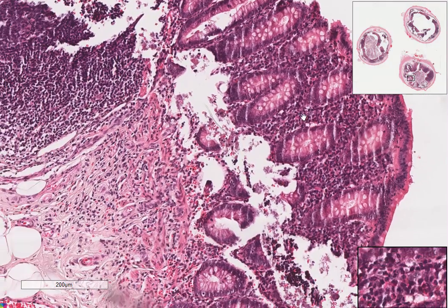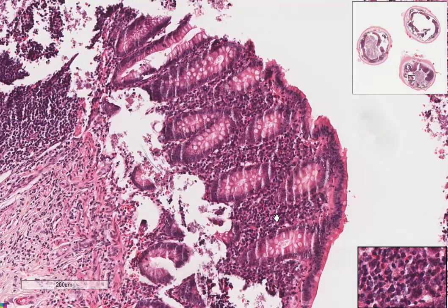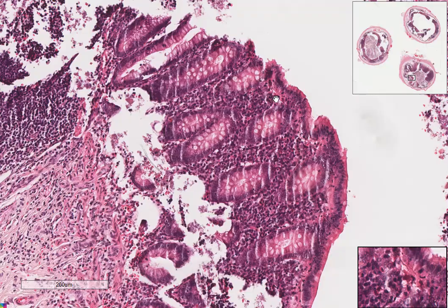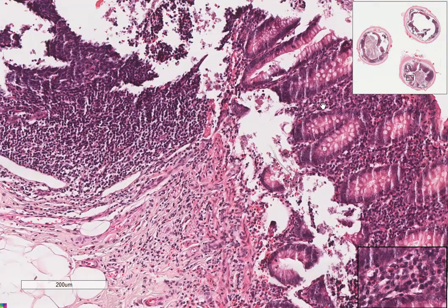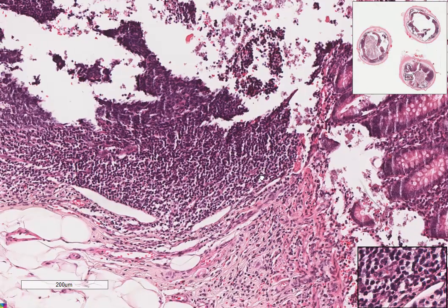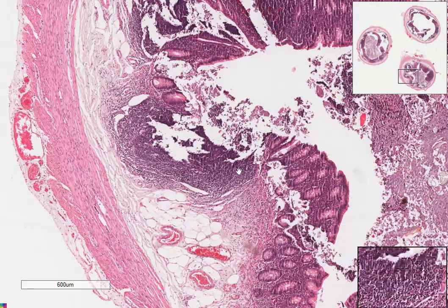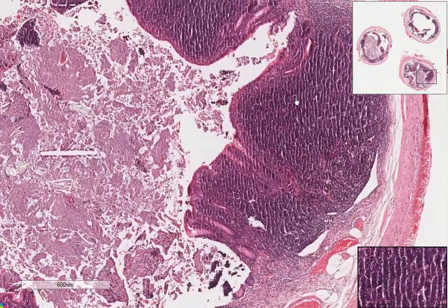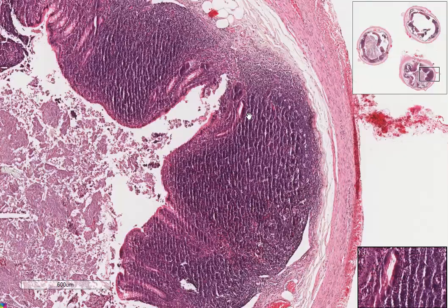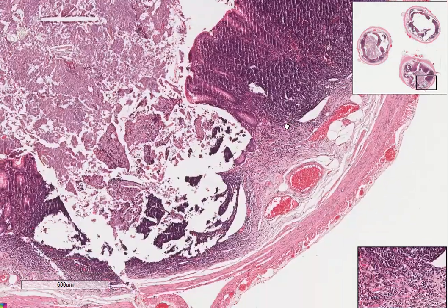And then this is the lamina propria, which is highly infested with inflammatory cells, which is normal. So these are lymphoid cells, and if you remember in the appendix, we've also got mucosa-associated lymphoid tissue, your MALT, which is all this which we see here, lymphocytes. All these are lymphocytes tissue. You can see them forming nodules. This is MALT, mucosa-associated lymphoid tissue.